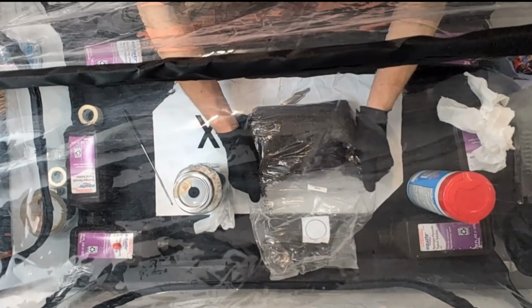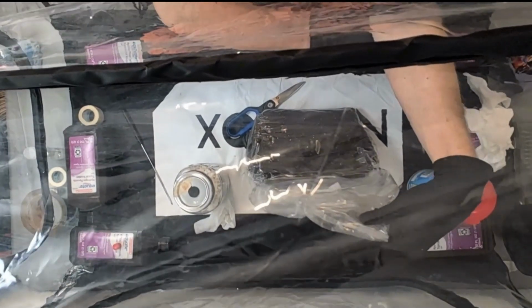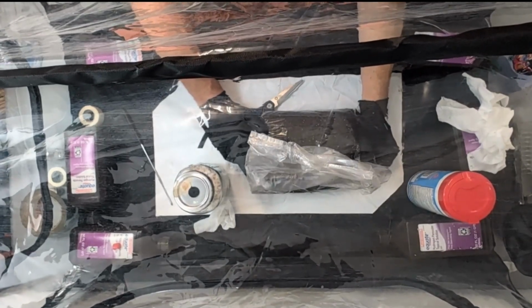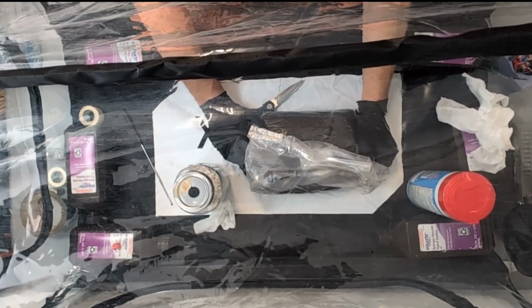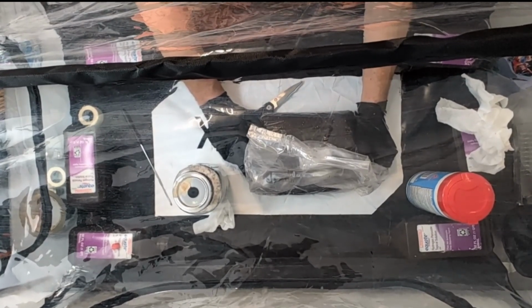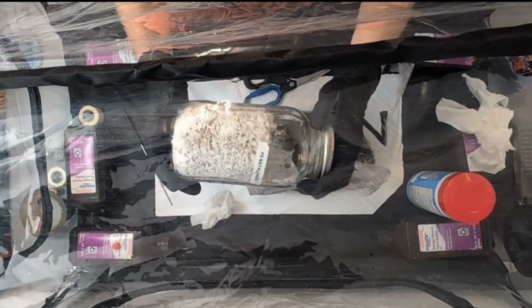This is a sterilized bag of CVG. I've been having a lot of problems with contamination lately, so I wouldn't usually sterilize a bag of CVG, but I really need to get my groove back. And I believe having a successful grow is the best way for me to do that. So I took the sanitization and sterilization way more seriously on this grow. And I will probably, most likely, if I have any sense about myself, be practicing those same methods in the future.